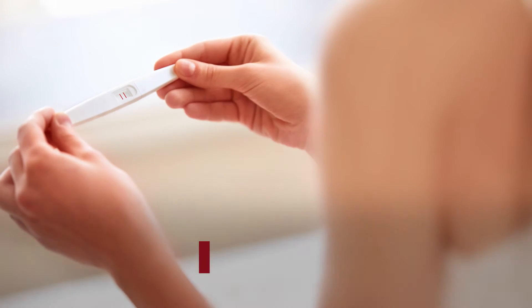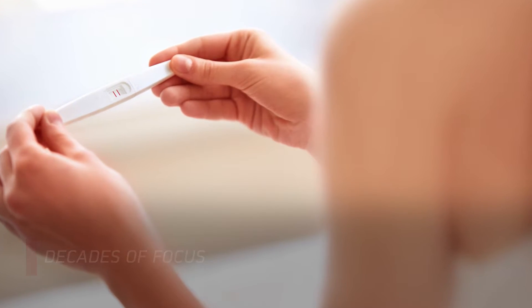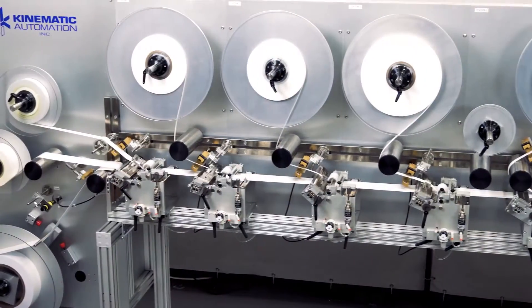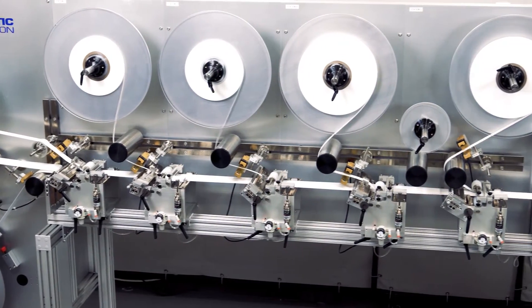Their experience and expertise comes from decades of focus on the test strip industry and their technologies have evolved and improved as they have solved problems and simplified processes.